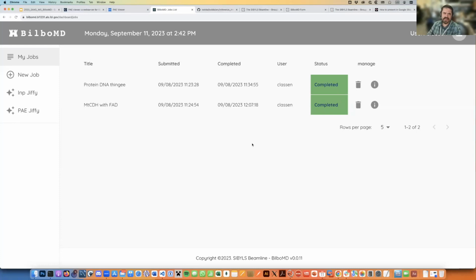I would think that people who have SAXS data probably want a little more control over what their starting model is. Maybe not. I don't know. You tell me. I don't collect SAXS data. Would that be useful to you? You'd put in an amino acid sequence and SAXS data and just say go. Yes, that'd be useful.